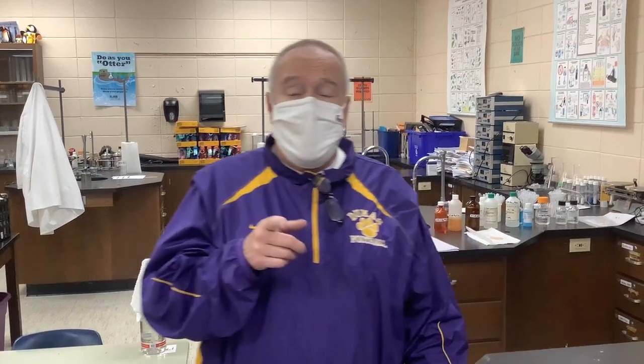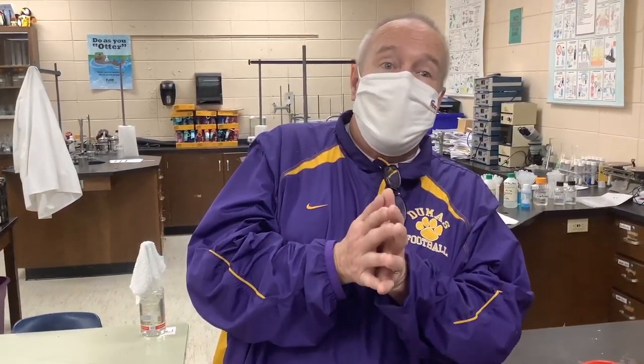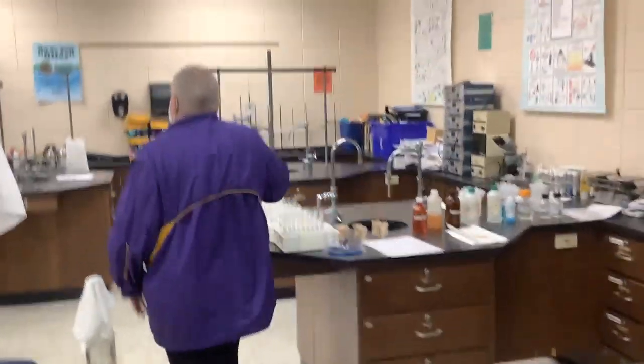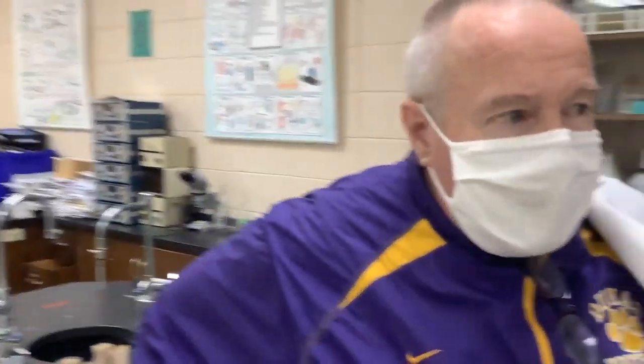Hello, dear students. Today we're going to do a quick lab where we continue writing chemical names and chemical formulas for substances, only this time they're substances we create in a chemical reaction. Our next topic is chemical reactions. We're going to start with two solutions, mix them together, and make a third compound in what's called a double displacement reaction, a substitution reaction, or a precipitation reaction.